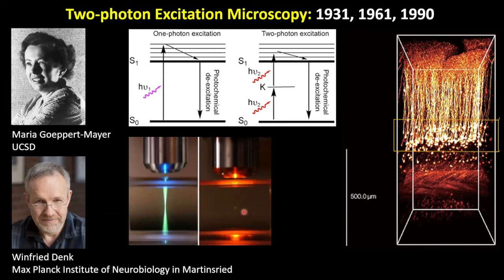And also because it's such a precise focus, and because the laser is powerful enough, you can also use this laser for precise injury damage to the samples. Here's just one example of imaging. Usually people use this in neuroscience for imaging the mouse brain, for example in live animals, and they can image much deeper into the tissue.